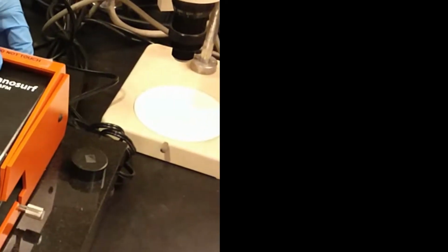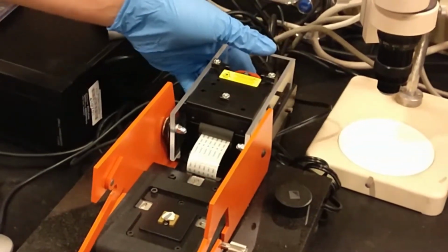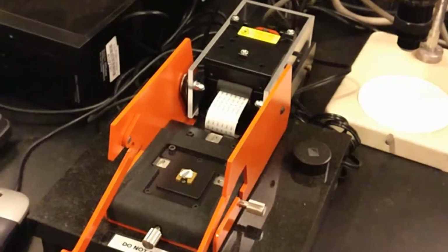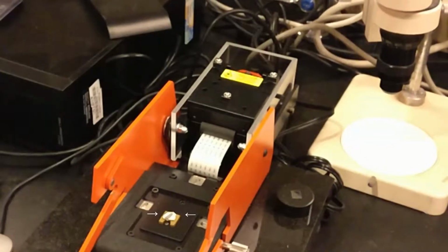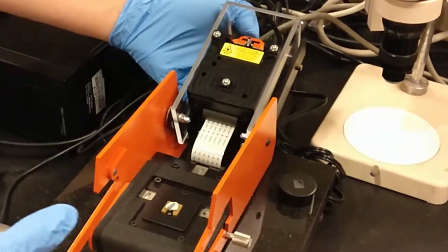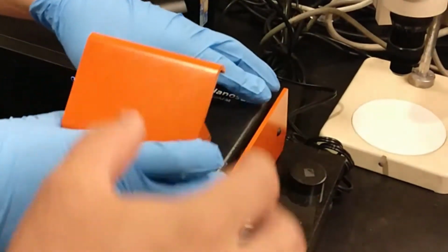In order to put a sample into the AFM, it's important to carefully open it to avoid damage to the machine. Once the AFM is open, if you would like to add a sample, just make sure it's not too large and put it onto the square holder. Once the sample is added to the AFM, carefully close the device, ensuring you do not cause damage.